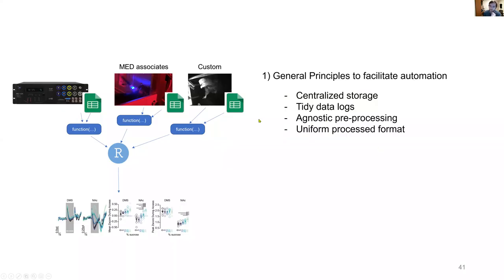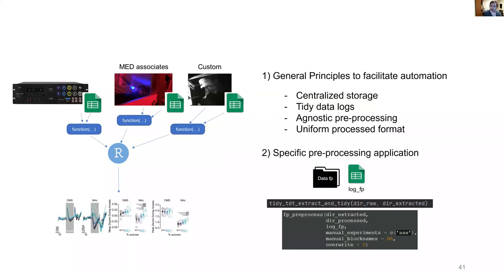And finally, having a uniform process format that allows you to apply the same analysis to different types of data easily. For our specific pipeline, this shows these principles in action, where from the user's perspective, you only have two lines of code and your data log, and it will automatically process all of the data that you have included within your folder and log.